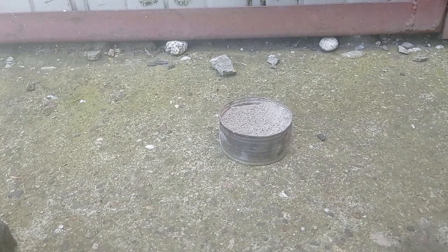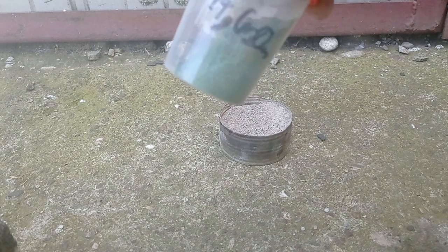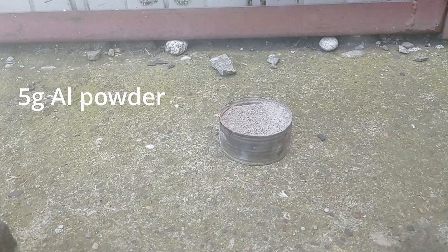Okay, now it's time for chromium oxide thermite. I've got here again 5 grams of aluminum powder and 14 grams of oxide.